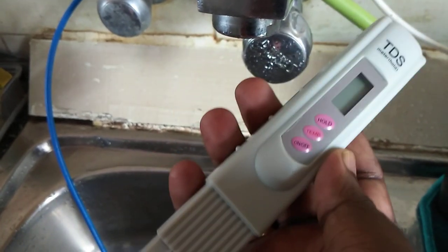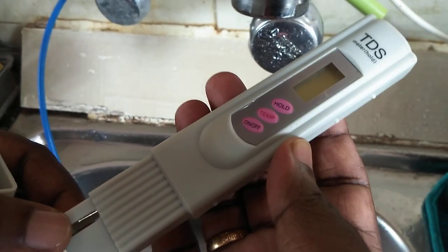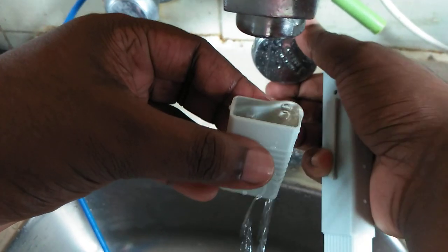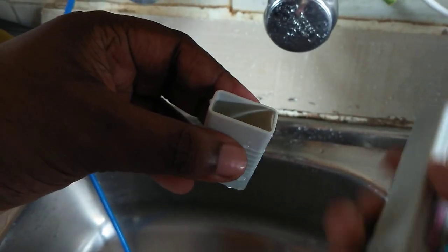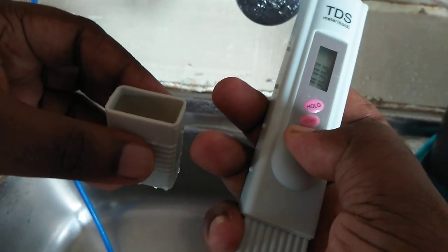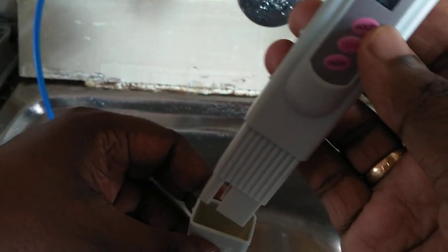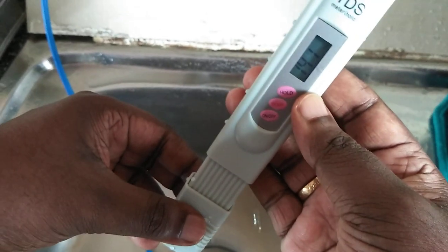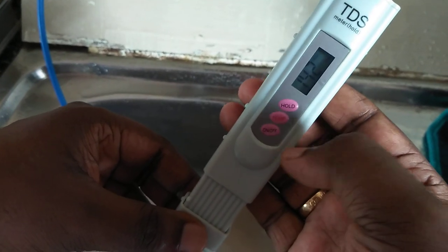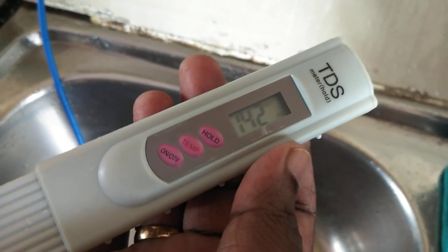Now I am going to test the purity of tap water, so for that I am using this TDS meter. First, take some water, then switch on the meter — you can see zero zero zero. Then immerse this meter into the water like this, then click on hold. Now you can see the reading is showing 142.